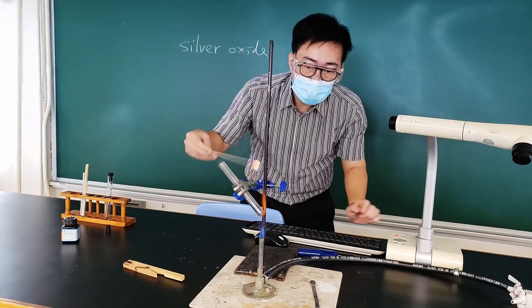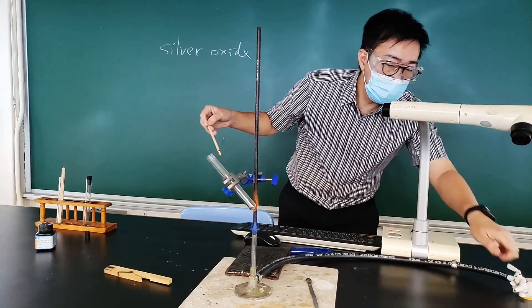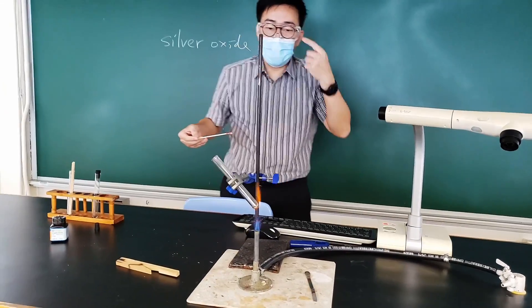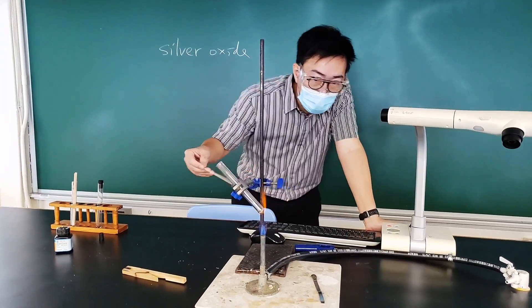Of course, we have to wait for some moment. It's okay. Yes, you see, I have been wearing the safety goggles since I lighted the burner.